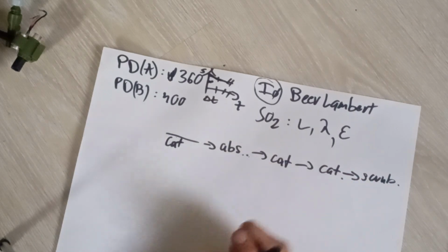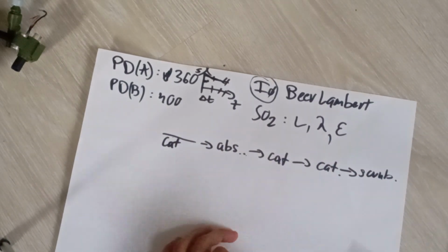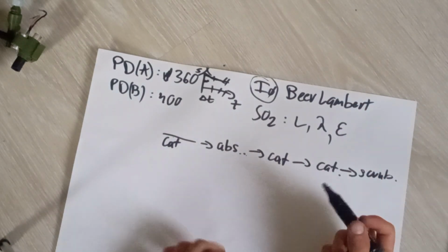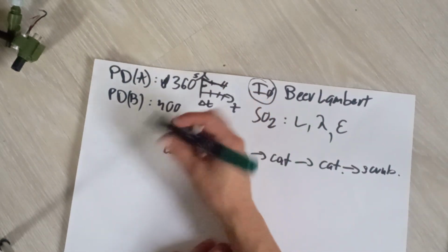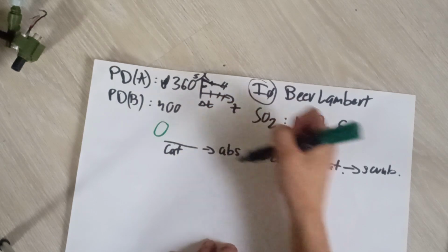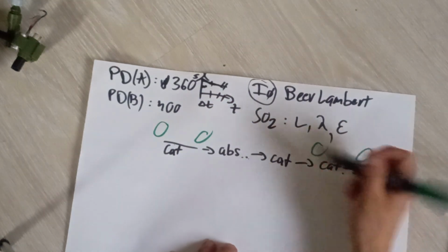We take readings in concentration, because I bought an LED that has 4 LEDs on it. We measure the concentration here, here, then here and here.